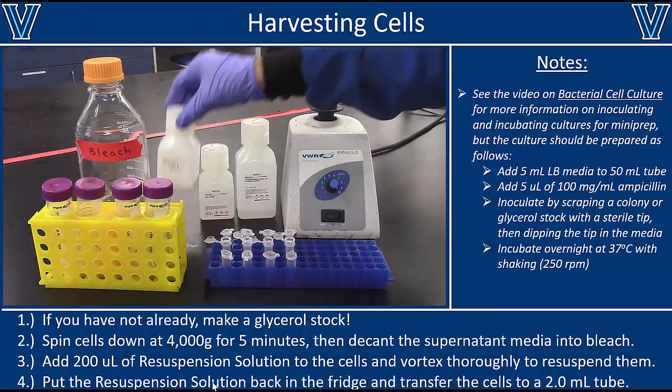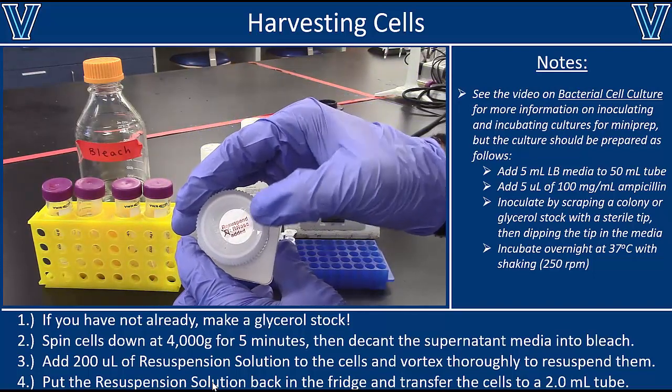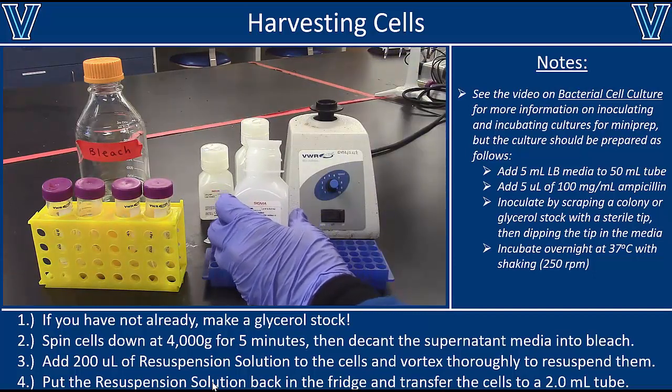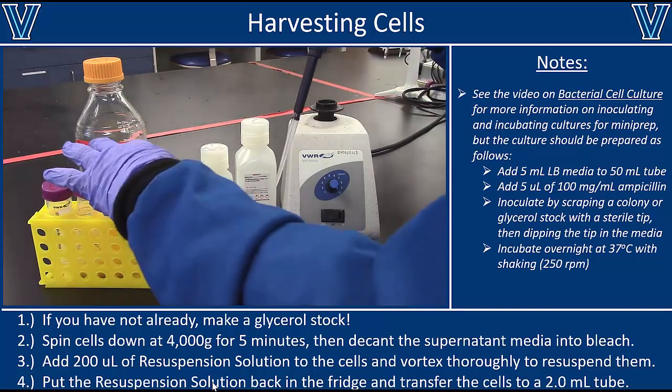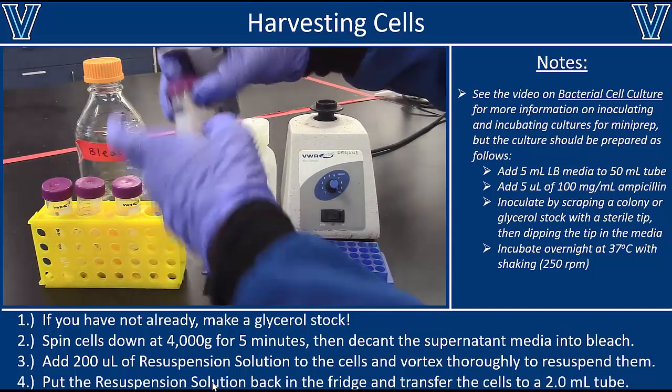And then to each of the samples, we're now ready to add resuspension solution. So you want to check to make sure the RNase has been added. If it has not, then take a moment to add it here. But if you do have RNase in there, then you want to add 200 microliters of resuspension solution to each one of your samples.